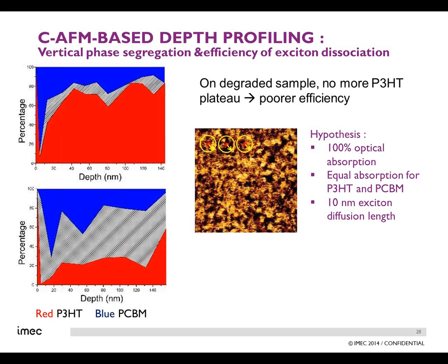And what we have been doing in this case was to study the aging. For organic materials, one of the very crucial aspects is that these materials degrade, they age extremely fast. And that's what you can see in the graph on the left-hand side here.